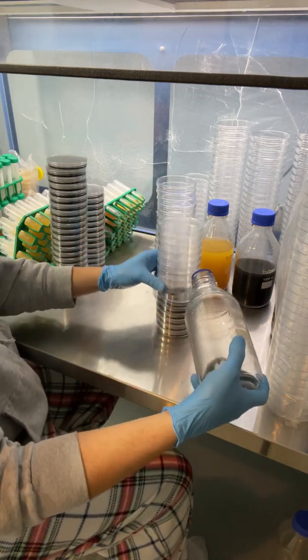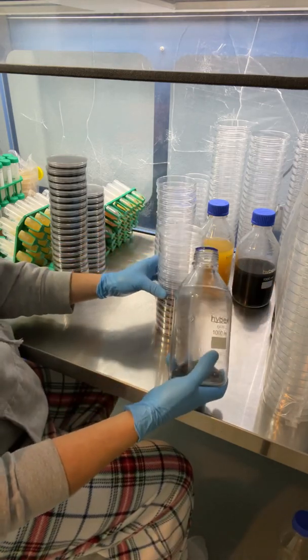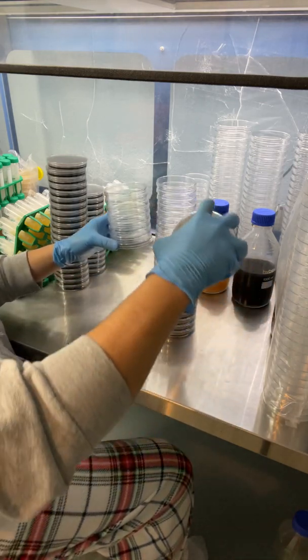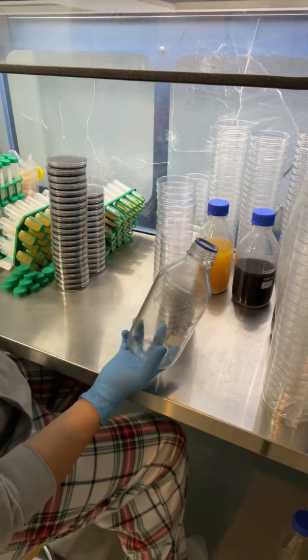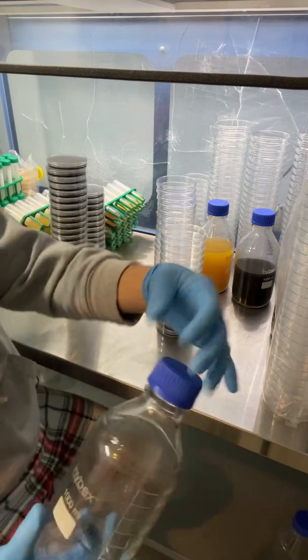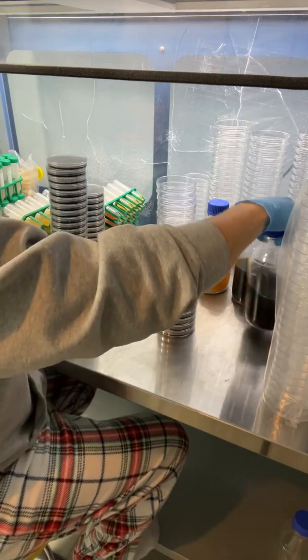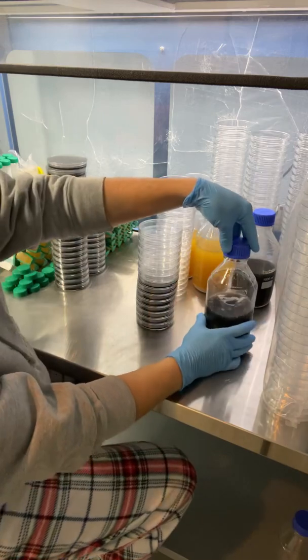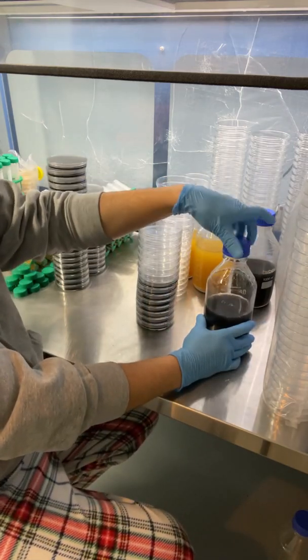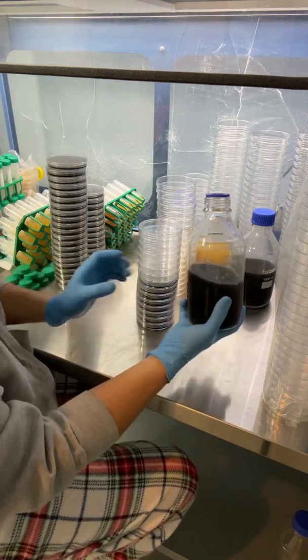I've been messing around with the black charcoal plates for about a year now and I really like them. You can see the mycelium pretty clearly and it's supposed to help inhibit the mushroom exudates when they grow. So especially for longer term storage, but I mostly just use them for production.